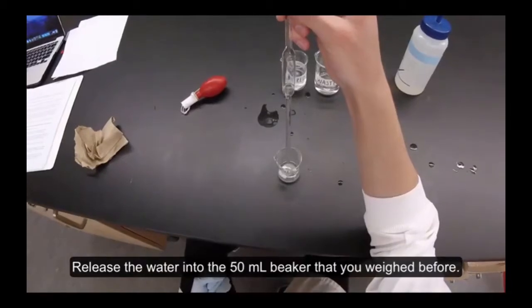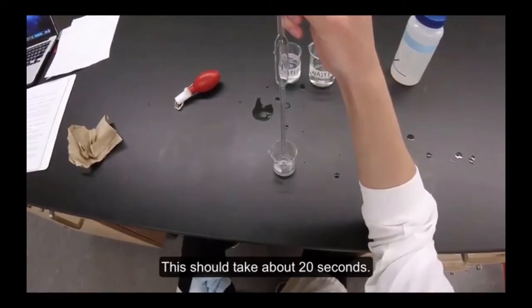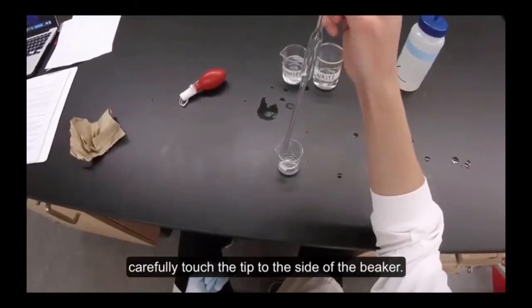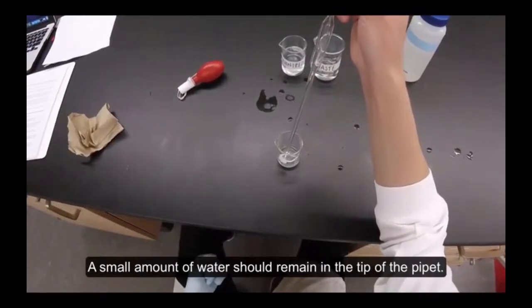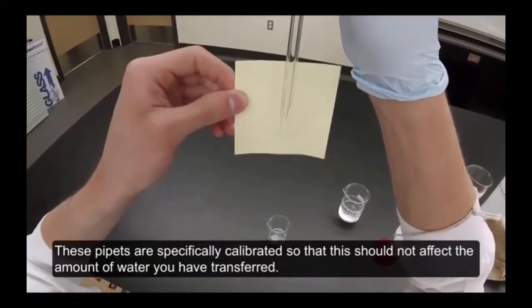Release the water into the 50 milliliter beaker that you weighed before. Wait for the pipette to completely drain. This should take about 20 seconds. After your pipette has completely drained, carefully touch the tip to the side of the beaker. A small amount of water should remain in the tip of the pipette. These pipettes are specifically calibrated so that this should not affect the amount of water that you've transferred.